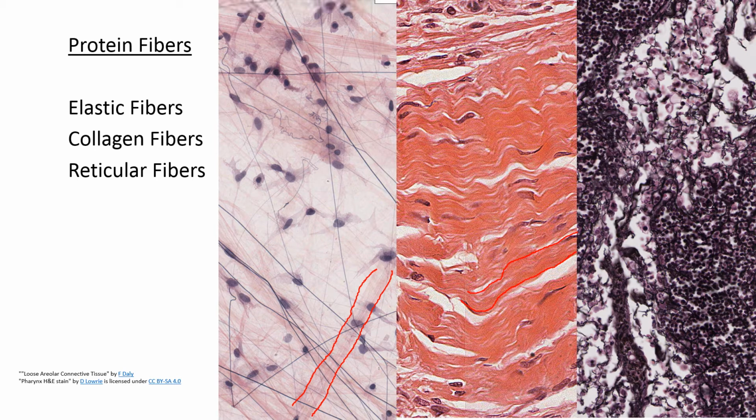In the middle picture, we're looking at bands of collagen fibers. So this might be one, but it's kind of bundled together to make a band. Over here, we're looking at individual collagen fibers. They'll be the kind of thick strands that run through the microscope image. Next, let's look for some elastic fibers. So elastic fibers, remember I told you they look kind of like squiggly threads?